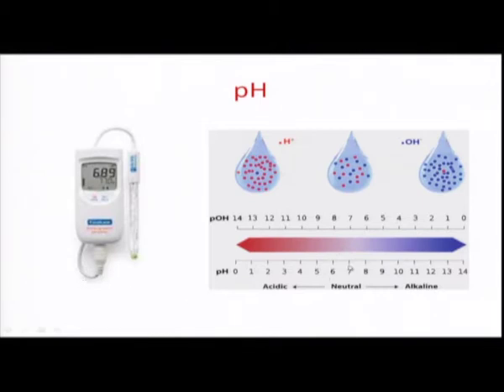pH: a neutral pH is 7, and sometimes we encounter acidic pH or alkaline pH also. Due to the presence of hydroxide, carbonate, bicarbonate, water may appear alkaline, and due to acidic impurities the water may be present as acidic also, below 7 also possible.